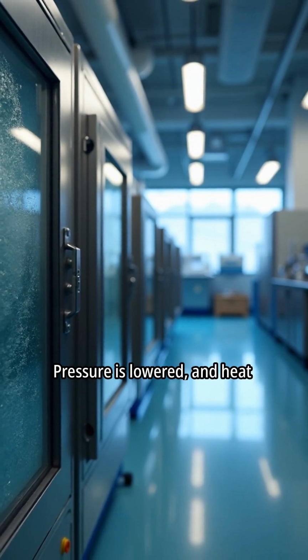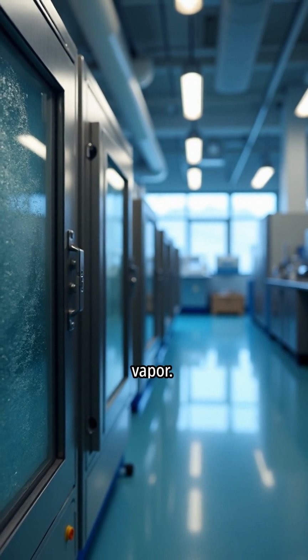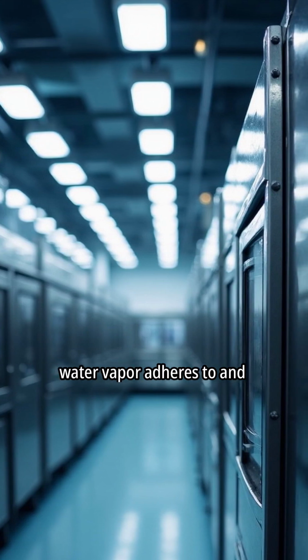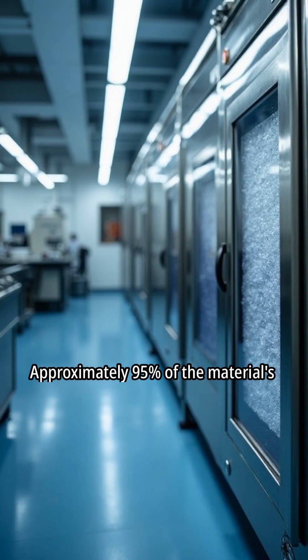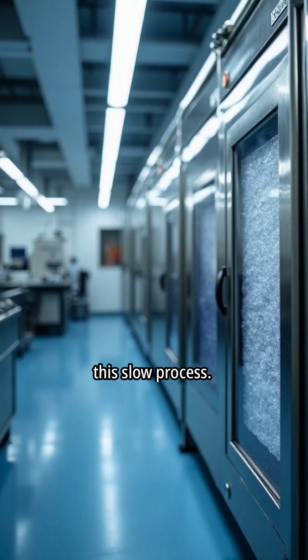Sublimation. Pressure is lowered and heat is added to allow the ice to sublimate directly into vapor. During the primary drying phase, water vapor adheres to and solidifies on the cold condenser surface, protecting the vacuum pump from moisture. Approximately 95% of the material's water content is removed during this slow process.